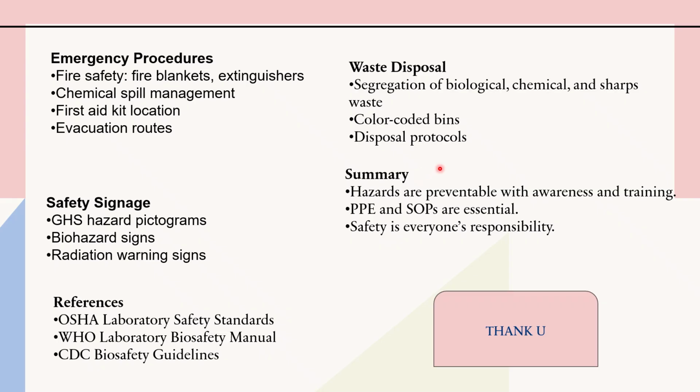Now, summary. The hazards are preventable with awareness, training, and use of PPE, and SOPs, or standard operating procedures, are essential. Safety is everyone's responsibility.